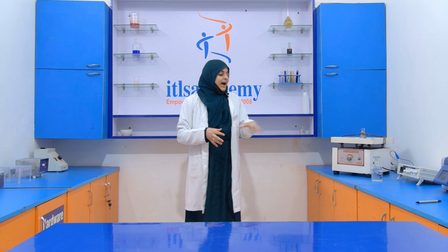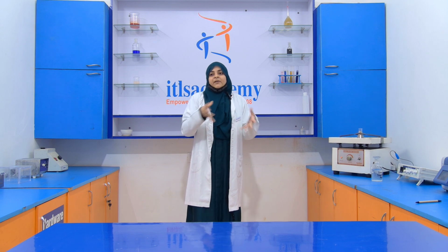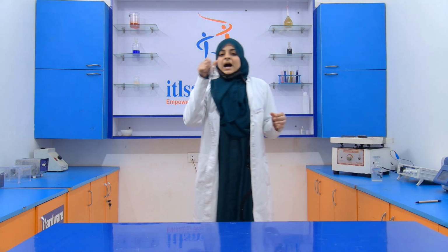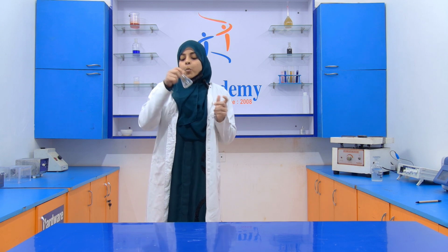And every 30 minutes during the 3 hours, I change this buffer with fresh potassium phosphate buffer, and after 3 hours we get our dialyzed protein. So we will meet after 3 hours. After 3 hours of changing the buffer every 30 minutes, we get our dialyzed protein.